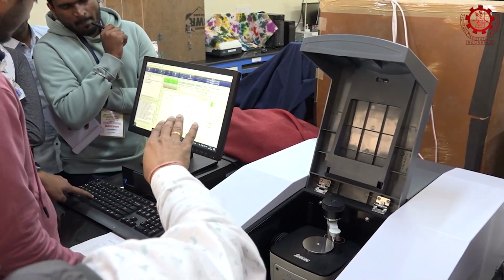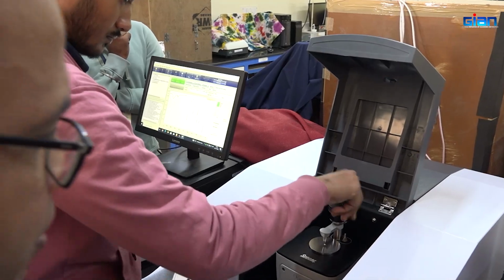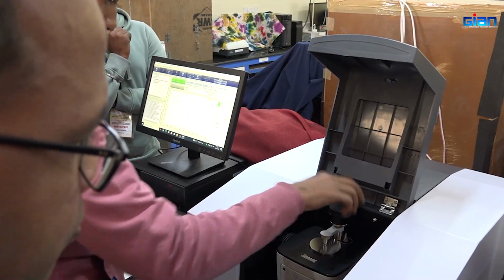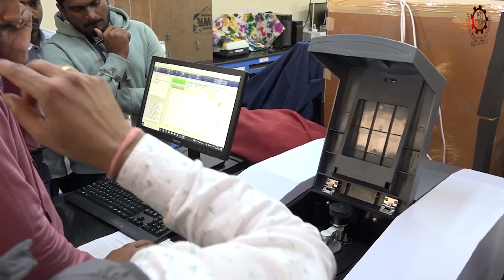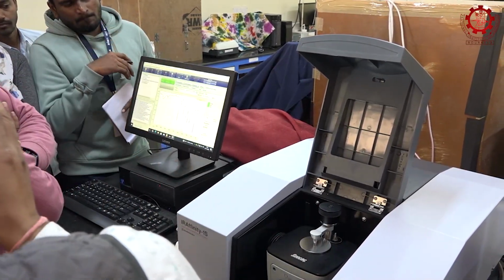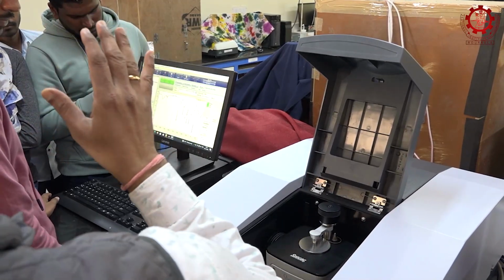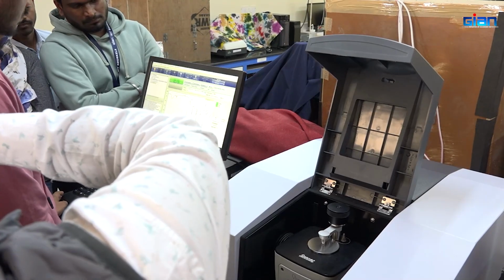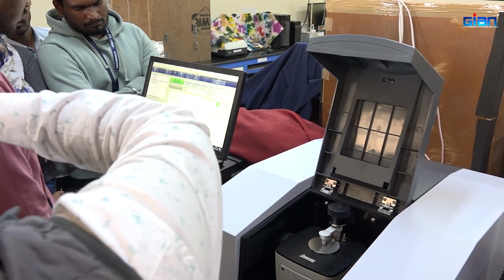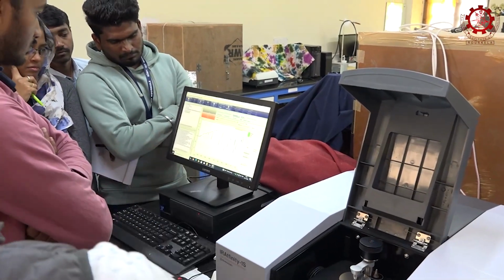So, now he put it as another sample, and so you can see there. Now he pressed exactly where this IR radiation is coming. So, he pressed that one, and mostly it will be uniform because we have applied pressure. So, now it has pressed the solid sample, and okay, now the scanning is going on.